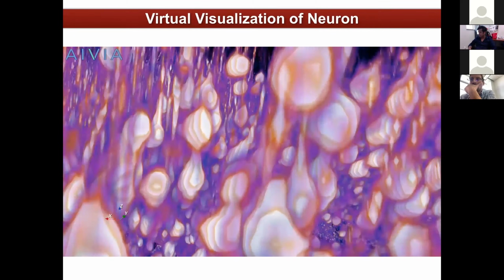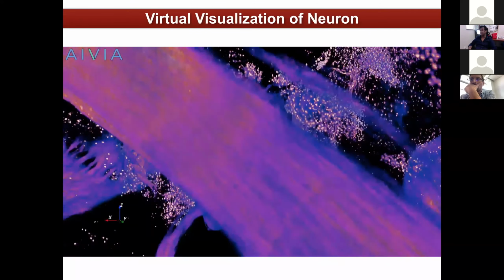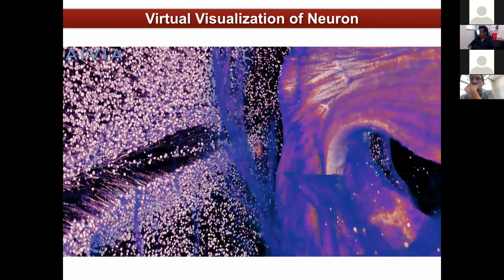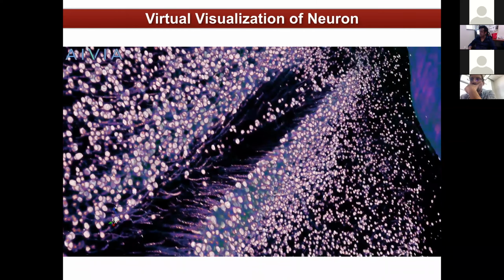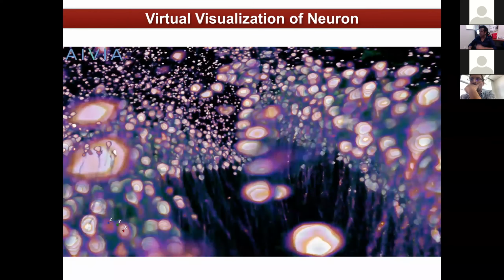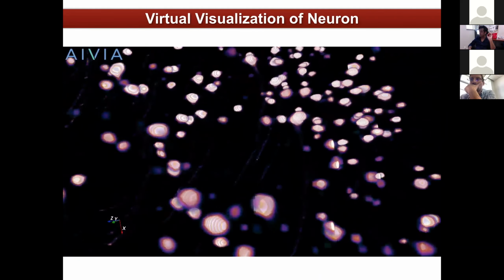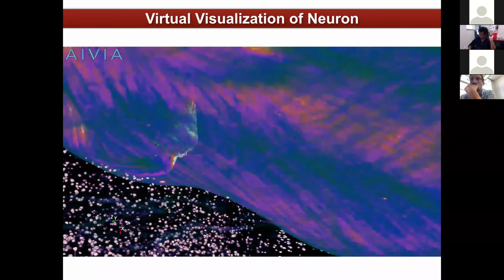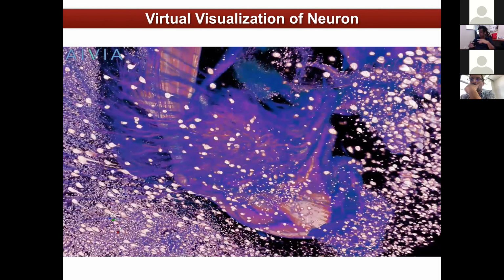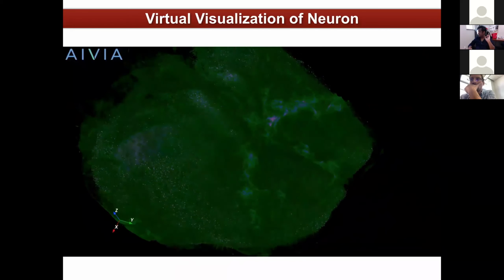But once you have trained the software, it automatically does the whole thing for you. To me, it appears like we are traveling through the universe, a solar system, or a galaxy. But that's what it is. You can see how well the pixels are defined, how well the grayscale regions are separated from each other, weaker grayscale separated from the stronger values as well.